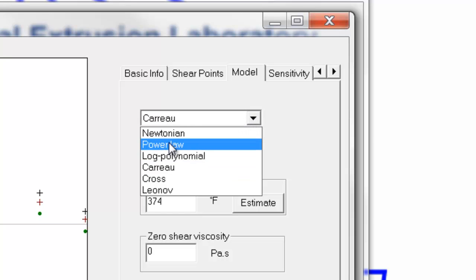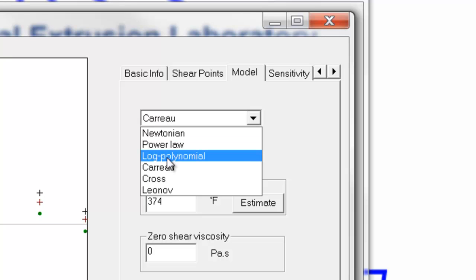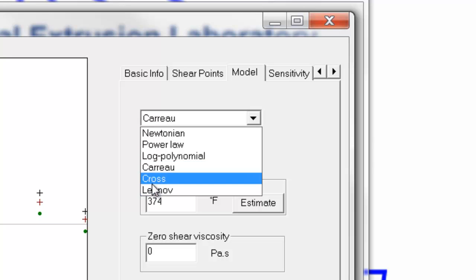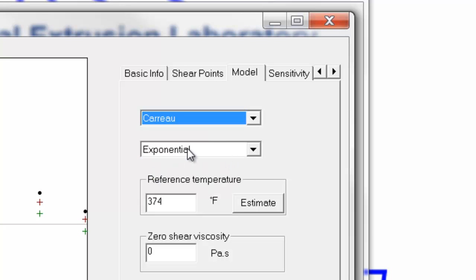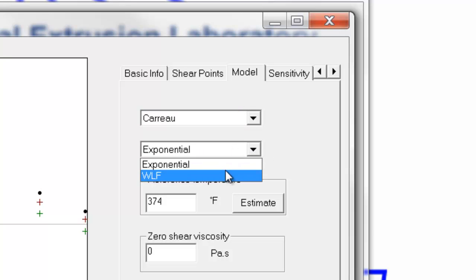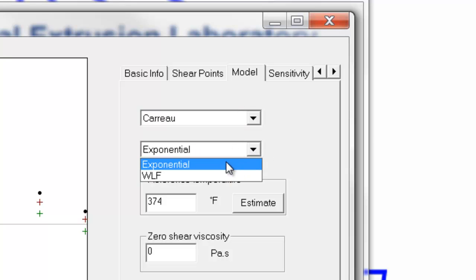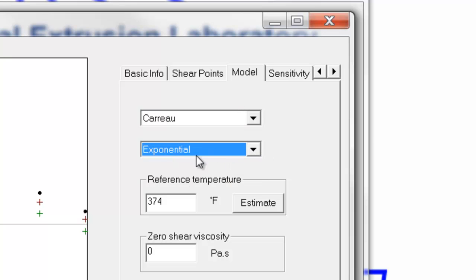On the model tab, we select which viscosity model we want to use for our data. In the past, the power law model was the most popular, and a log polynomial model will fit quite nicely, but it has no theoretical basis. What we normally recommend is one of these three models: Corot, Cross, and Leonov — and generally the Corot model is the most general to use. So we'll pick that, and for temperature we have WLF or exponential. Exponential works fine.